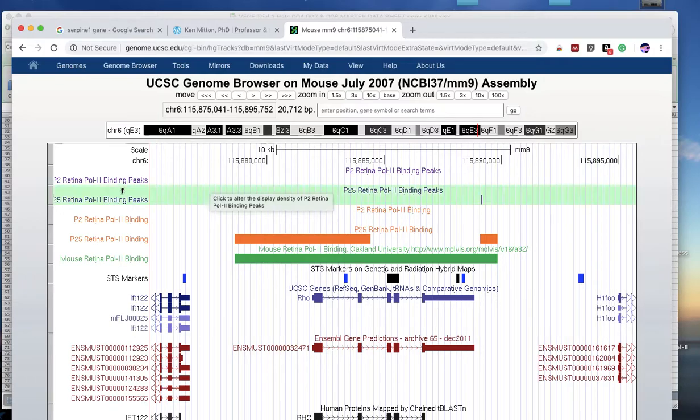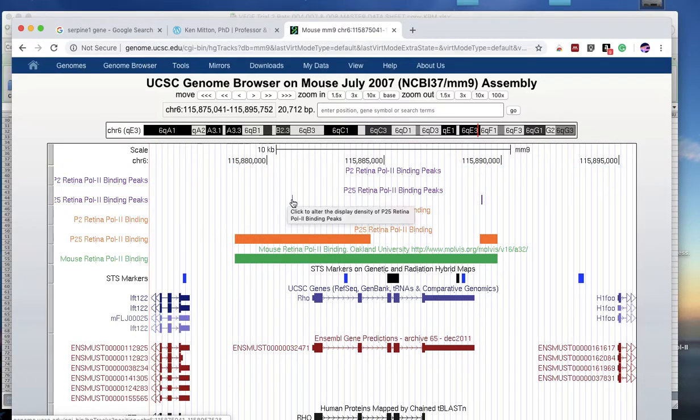The blue tracks up here will each show you a single line, which just tells you where we have RNA polymerase mapped in these genes. A peak signal, the most polymerase occurred here, and another peak occurred over here. We don't show you the data in little mountain range collections, but basically that's kind of what they look like.